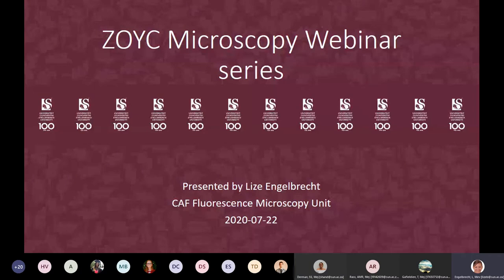Right, so today the whole idea is to talk about what we do with our images and how we analyze them. When I started to put this presentation together, I realized it's almost impossible to go through everything, so I'm going to touch on the basics. The first part of the webinar is not completely about what to do after the imaging, but actually how to get good images from the start. Because as you might know from previous experience, if your imaging isn't good enough from the start, there's almost nothing you can do if they weren't imaged in the correct way. So the first few slides will be about what things influence the quality of the image, and then I'll get into a little bit of what to do with those images afterwards.